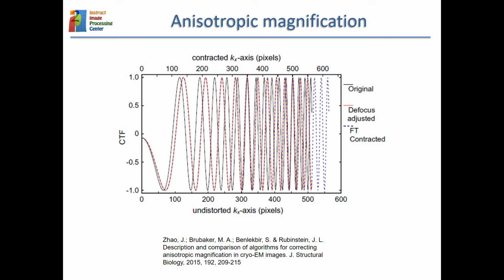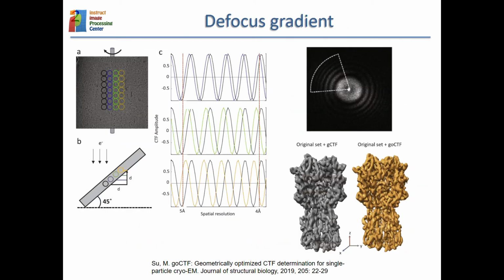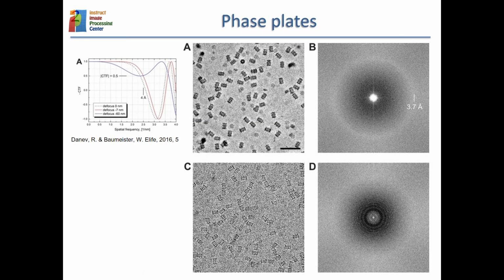So they are blacked out. They are removed from the final micrographs, and that is why we have so little contrast. But if you now make the CTF start, instead of at 0, at 1 or a number close to 1, then you see the particles very well with very high contrast.